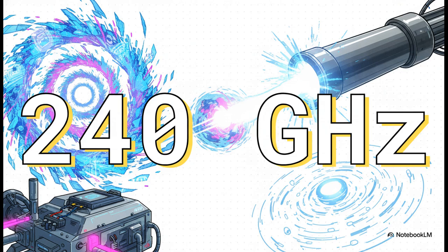And we are constantly pushing the extreme boundaries of this technology. A groundbreaking 2012 study achieved something incredible. They powered a pulsed EPR spectrometer at a massive 240 gigahertz. And they did this not with a standard microwave source, but by using a massive free electron laser.